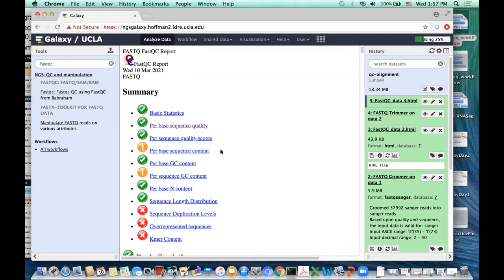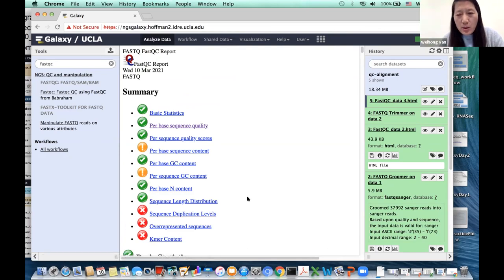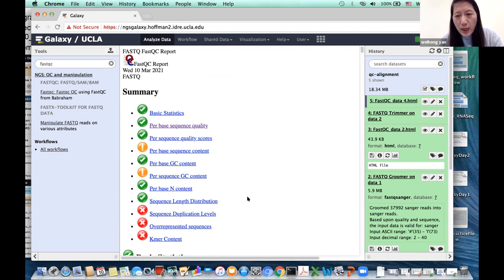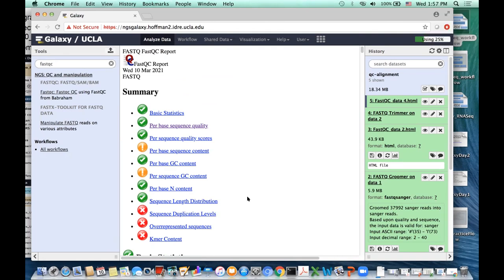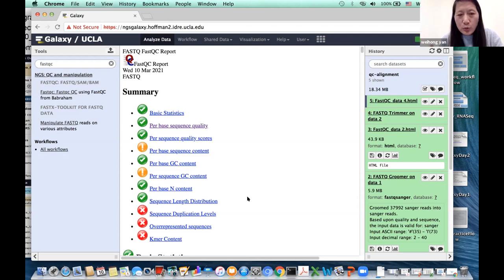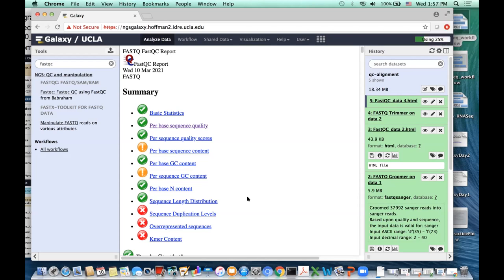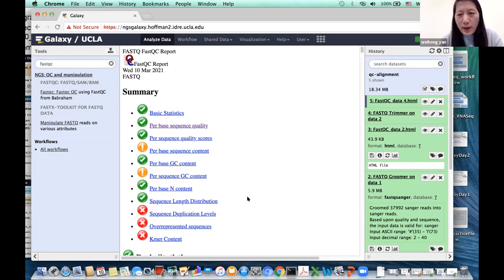I'm going to show the alignment with the trimmed sequence reads, but you can run your own using untrimmed. It may influence the alignment rate a little bit — you can try to compare the two results afterward. You follow the same procedure, just change the input, then compare results.